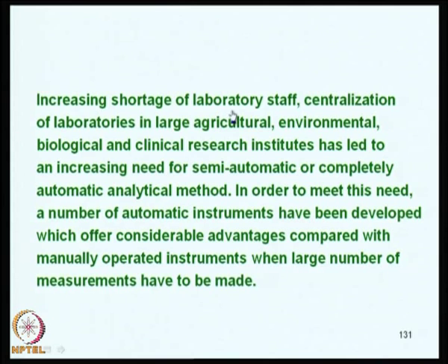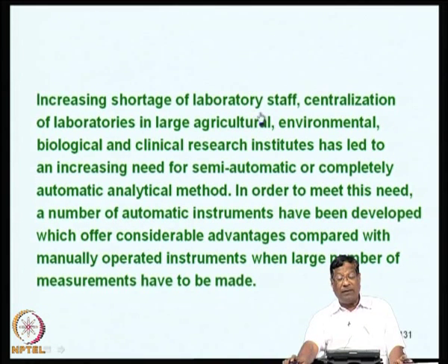Now, this increasing shortage of laboratory staff, centralization of laboratories in large agricultural, environmental, biological and clinical research institutes has led to an increasing need for semi-automatic or completely automatic analytical method. This point I have been stressing again and again, because the amount of effort that has gone into automation is something phenomenal, which has not been seen by any of the analytical technique.